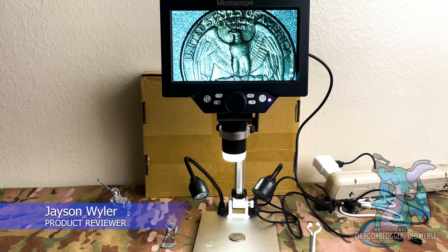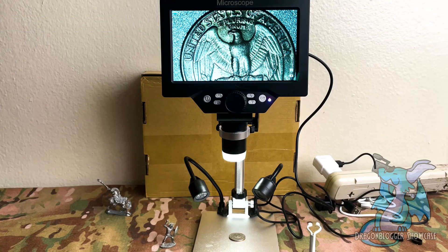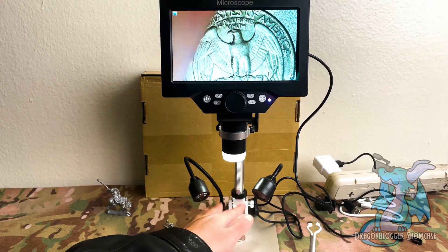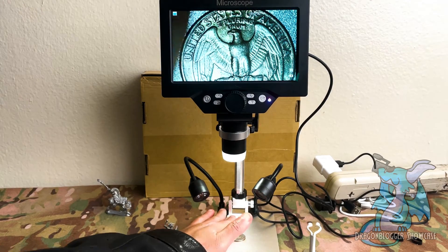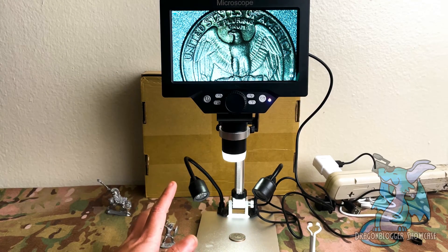Hey everyone, Jason here. Today we're checking out an LCD digital USB microscope, which is pretty neat. What you see before you is what it looks like when everything is assembled. It doesn't take very long to assemble, but you do have to put a few pieces together — you'll have to attach it to the neck as well as to the base so that everything stands up properly when you need to use it.